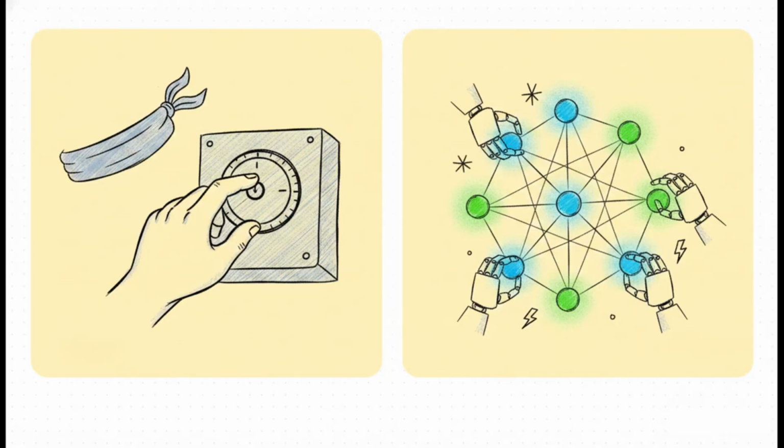So we have these four incredibly complex root causes. How do we actually fix them? We need a massive mindset shift. We have to completely abandon the traditional, inefficient OFAT method, where we test one factor at a time, and embrace the multivariate power of design of experiments, or DOE.